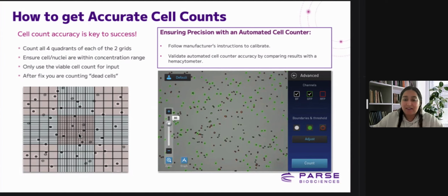But what we found is when you're working with bulk sequencing and bulk samples, it's okay if the count is under or overestimated. But with single cell, single nuclei, each count is very essential. We need to incorporate validation during the fixation, both pre and post, because we want to make sure that that automated counter is counting cells and not debris, not aggregation, and over-inflating our count of interest.